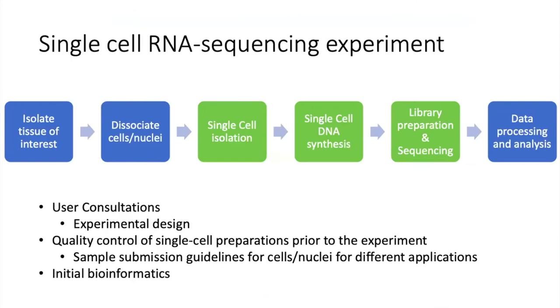So in our facility, we basically run single cell projects from the beginning to the end. We start by having discussions with our customers that contact us for an experiment, and then we try to help them with the experimental design of the project. And we also encourage them to talk to, for example, NBIS, the National Bioinformatics Infrastructure, if they have more complicated designs and questions. But the user, do you see my pointer?